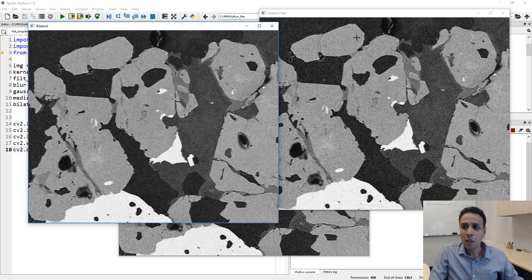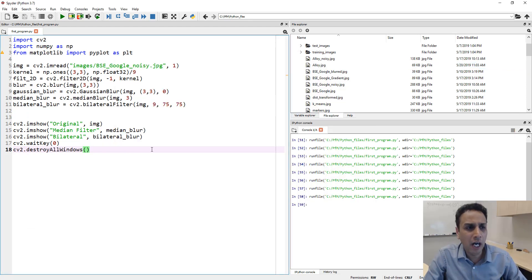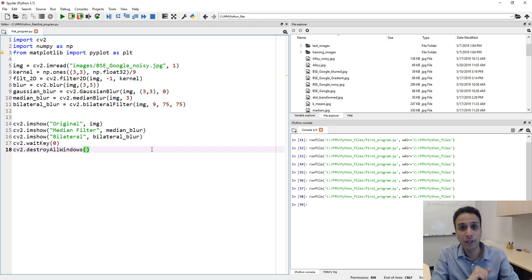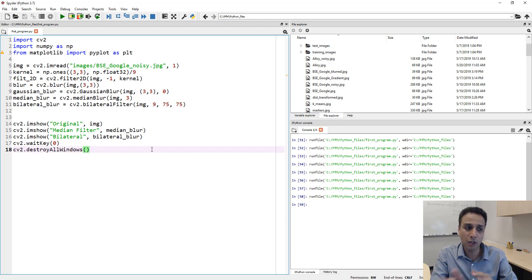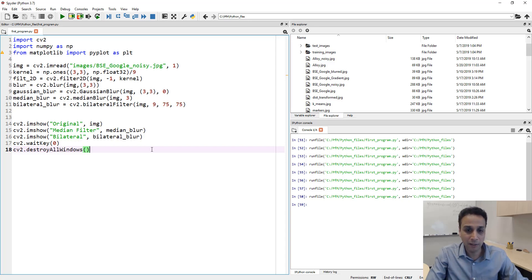One thing I won't cover right now is the non-local means (NLM) filter. It exists in scikit-image and I've covered it in a previous video. NLM does an amazing job filtering and denoising microscope images while retaining texture, which is very important in microscopy. I won't repeat that here, but it's worth looking up.